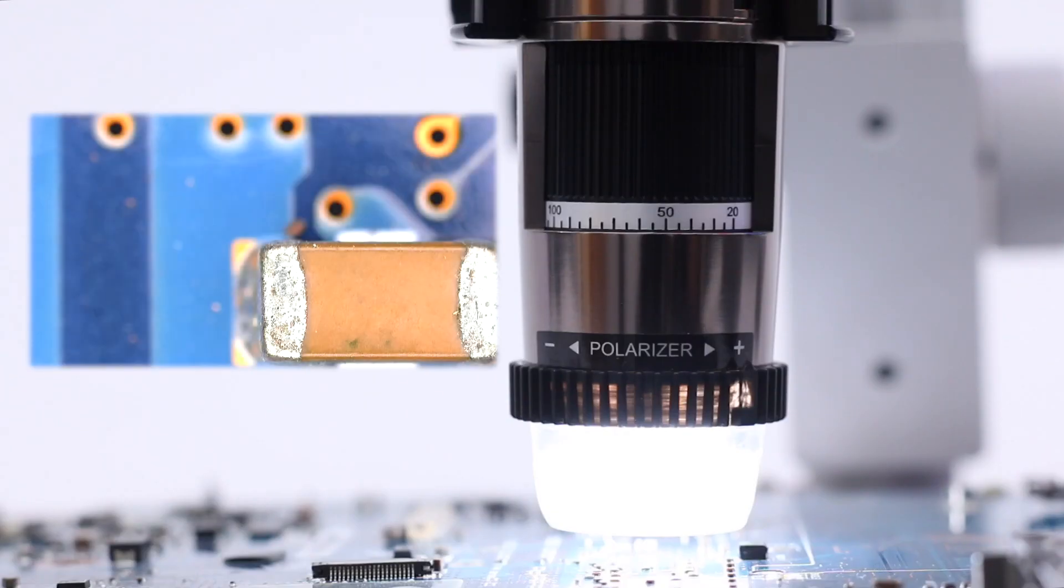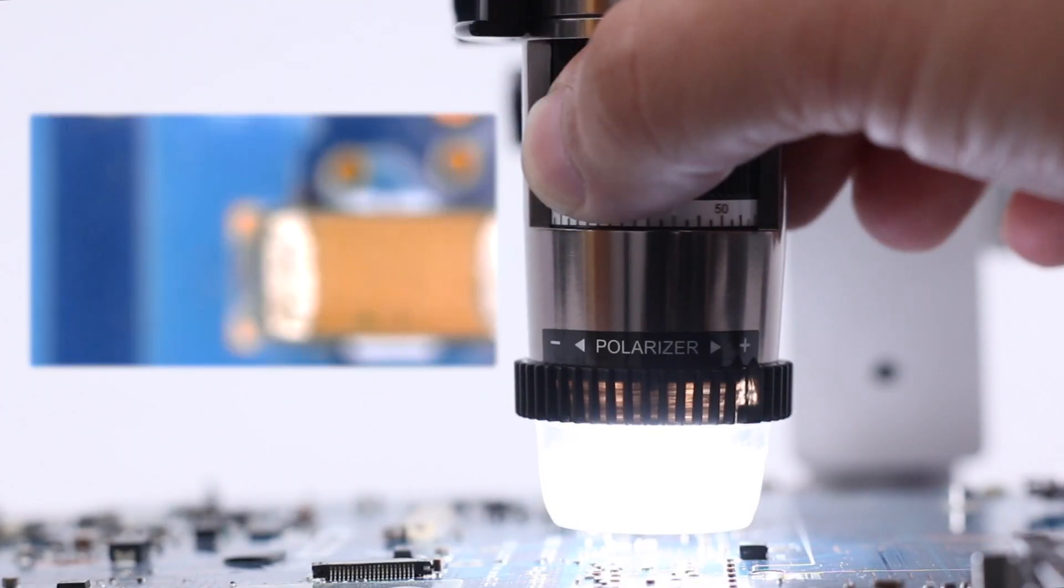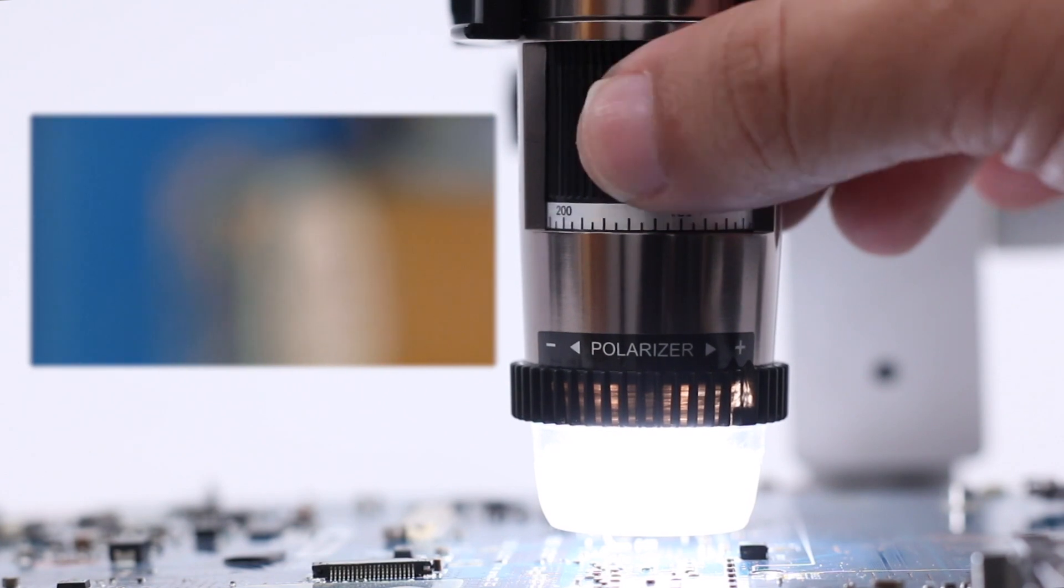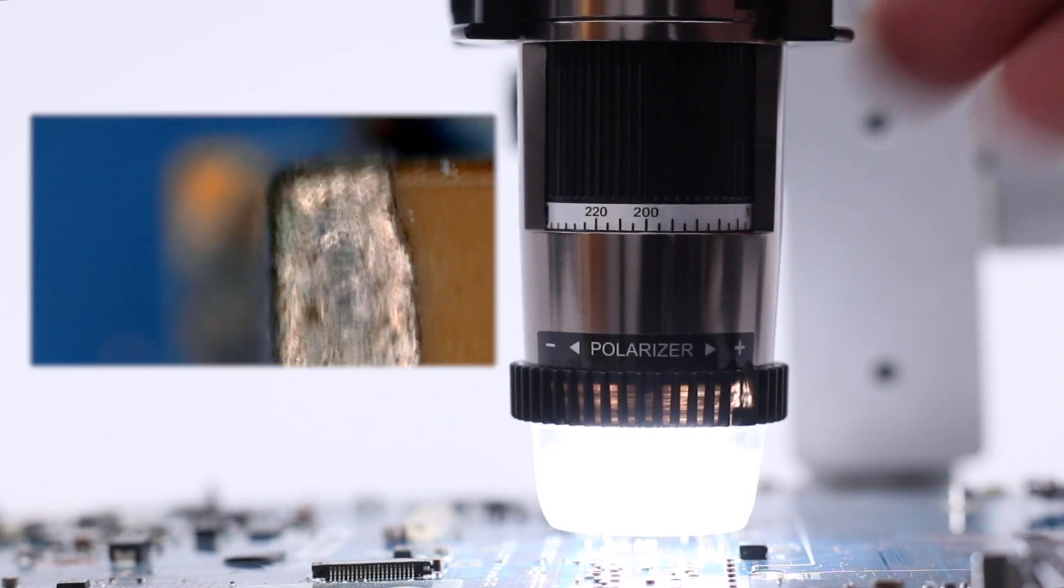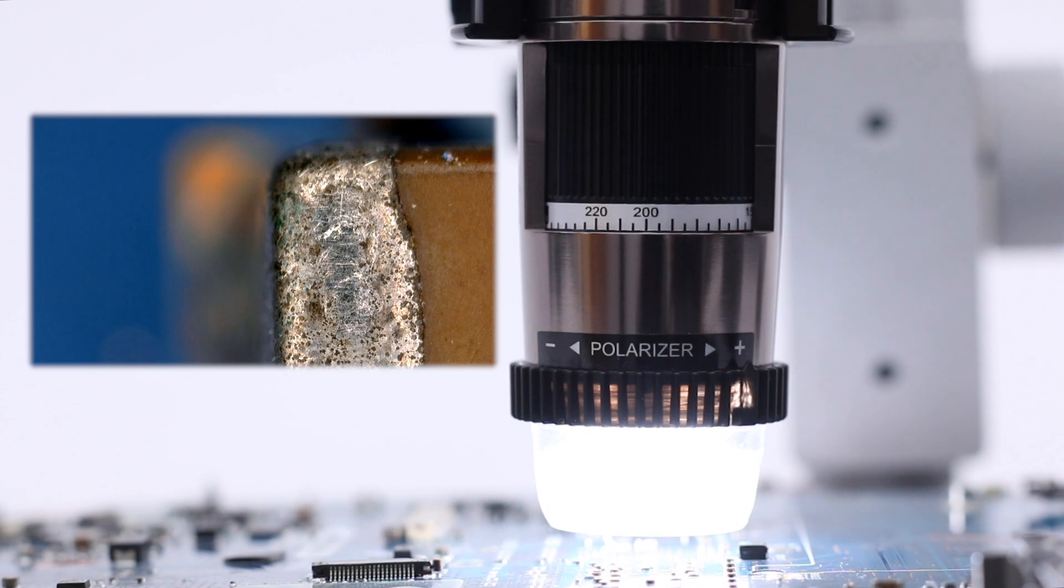As with all Dynalite microscopes, these have variable magnification. With the standard working distance model at about 50x, you can even increase the magnification and get a more detailed view at about 200x without changing the distance.